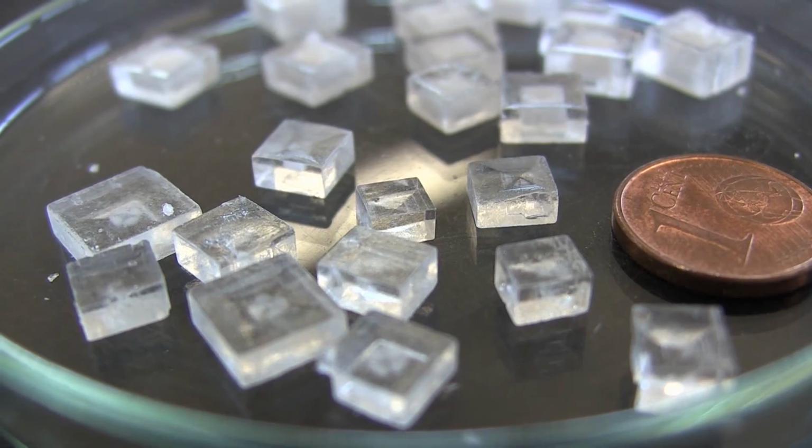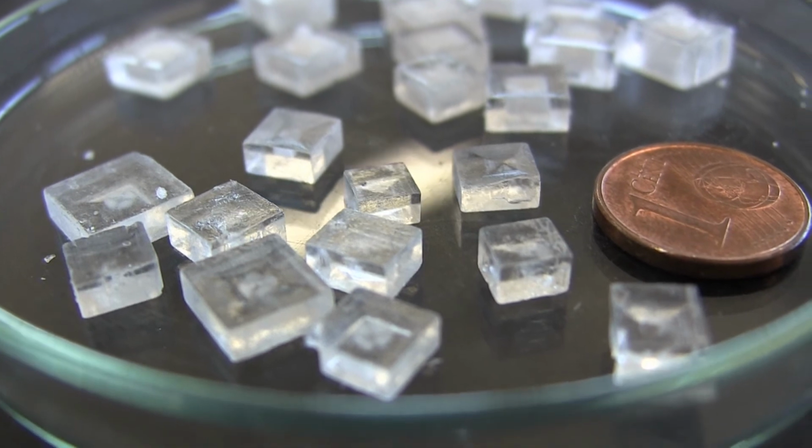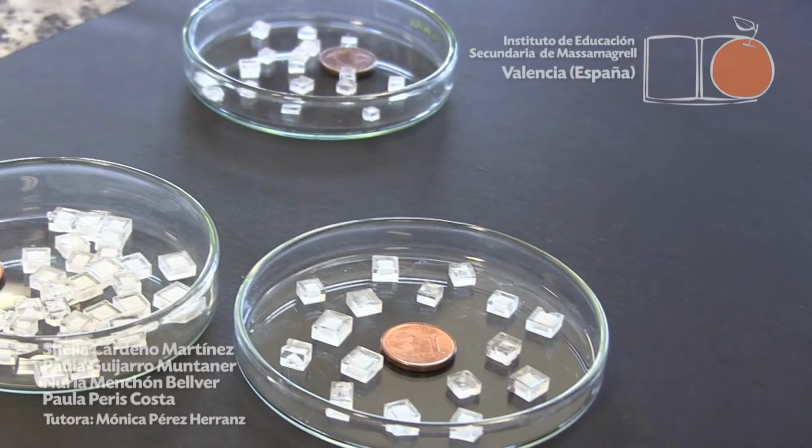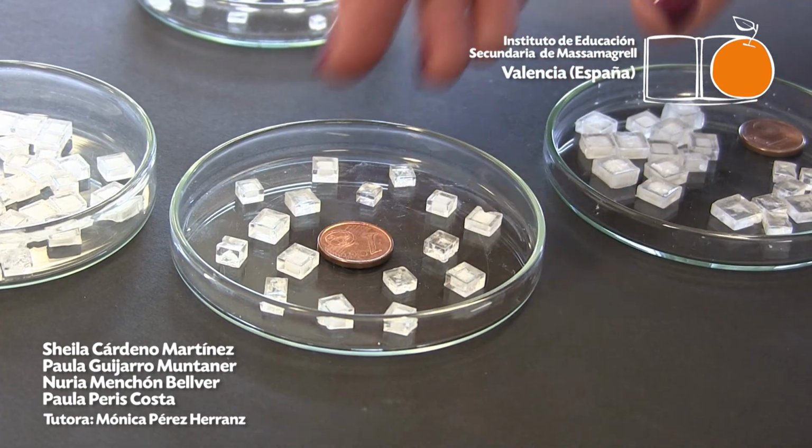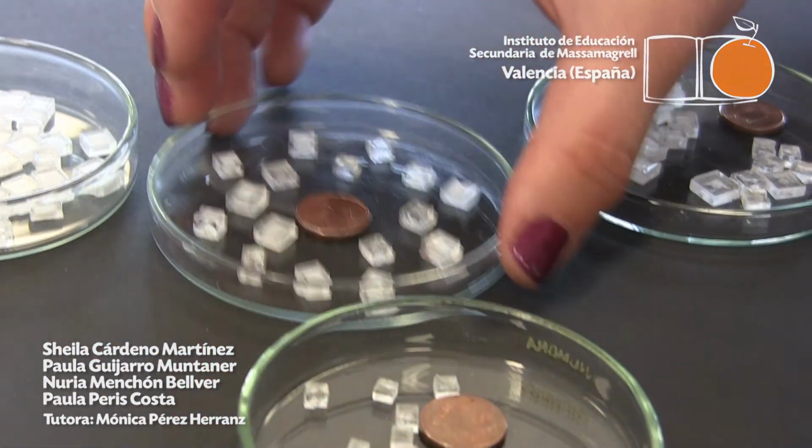In some crystals, a white cross is formed inside. That is water of crystallization. After this work, we can conclude that sodium chloride, also known as table salt or common salt, is not as common as its name says.